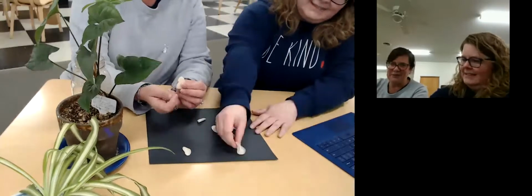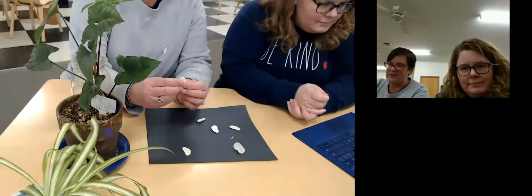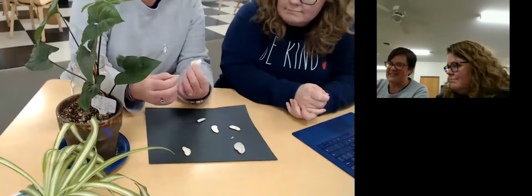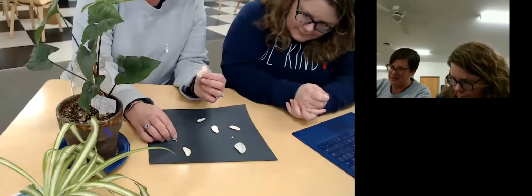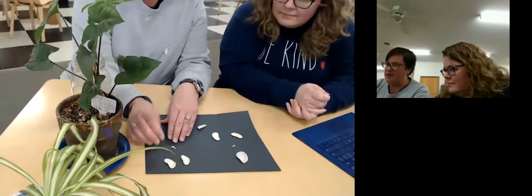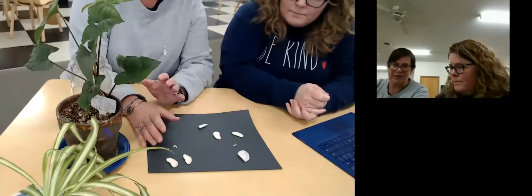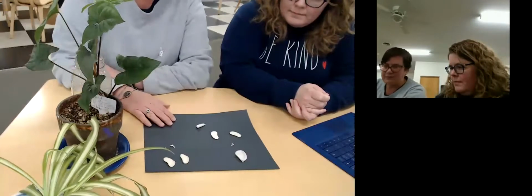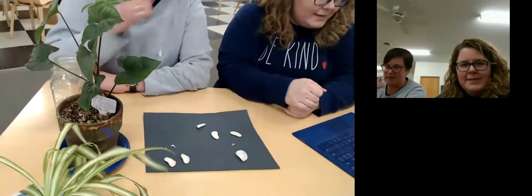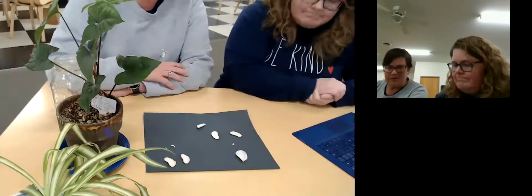So here on this piece that she's just taken apart, I want to point something out, that there is the embryo. I just broke it, it is easy to break. As you just saw, it's super easy to crush that part. So it takes a couple of tries to extract that from the seed, but you'll still be able to see all the parts nicely. And that's why we soaked more than one, so we could try as many times as we need to. Okay, so I'm going to go through the parts of the seed.